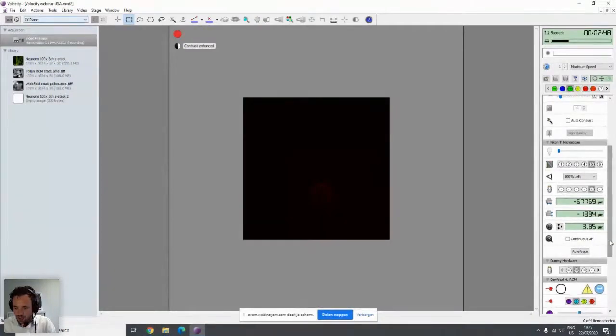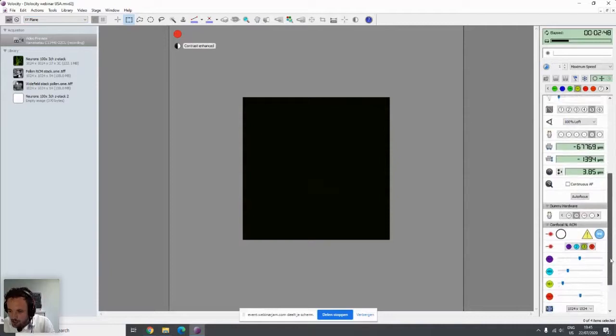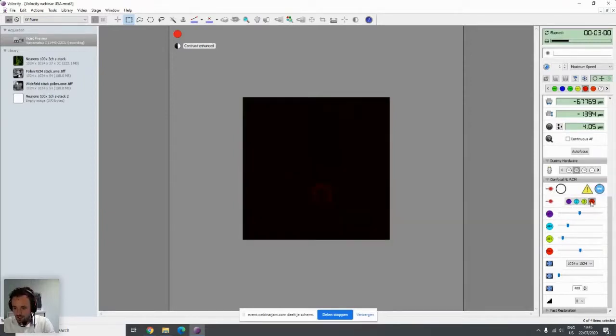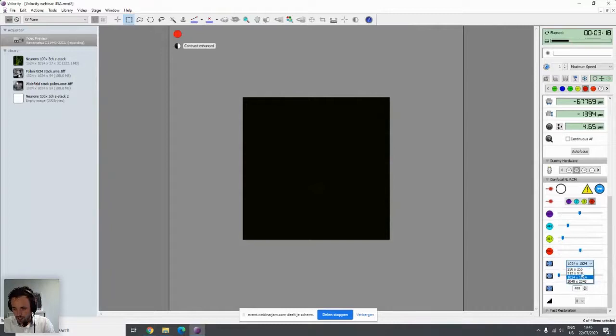So regarding the RCM controls, it's also quite an important thing, of course. So here we can see the RCM controls that we have within Volocity. You can see here is the laser selection. Since it's now scanning, it's automatically switching between laser lines. Here you have control over the output of each laser. This is the field of view of the camera. So you can see we have multiple fields of view that I can select.